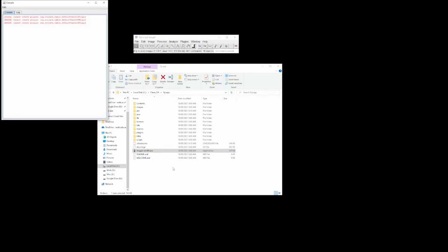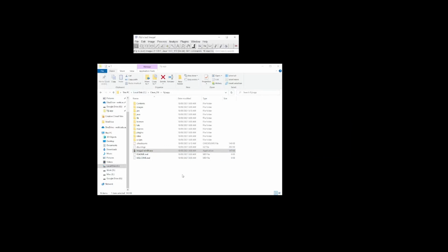So this may or may not be the case for you, but for now, I'm just going with configuring it from scratch.